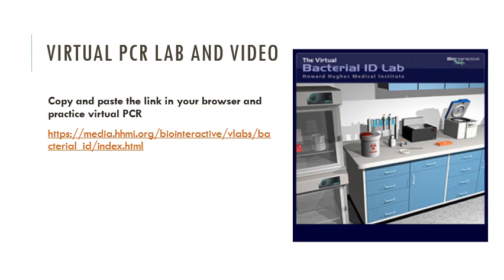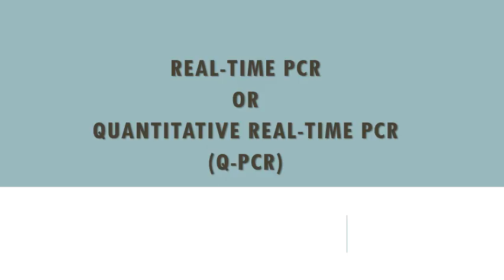If you want to explore more, you just go to this virtual lab and you will practice more PCR techniques. PCR, or what we call quantitative real-time PCR, qPCR.